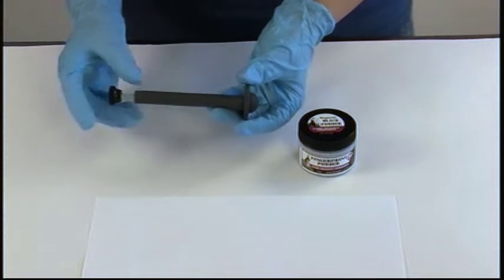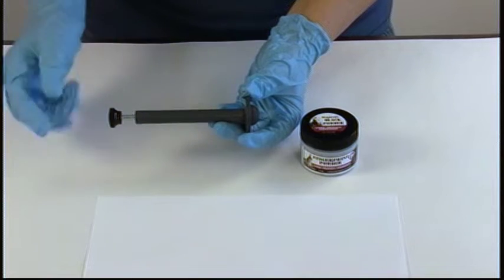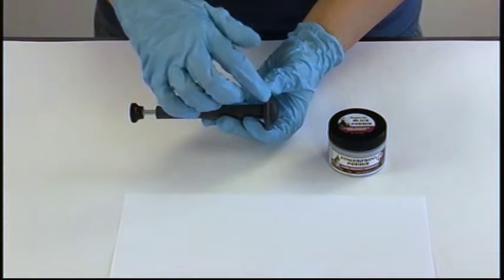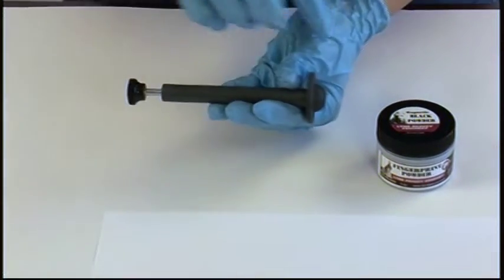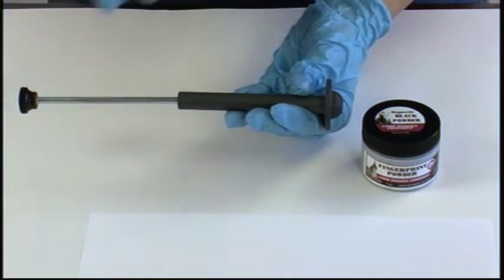The way this wand works is there's a magnet at the end of the plunger. When the plunger is fully depressed, the magnet is at the base and we can pick up the magnetic powder. When you want to release the powder, just pull up on the plunger and it should fall right off.